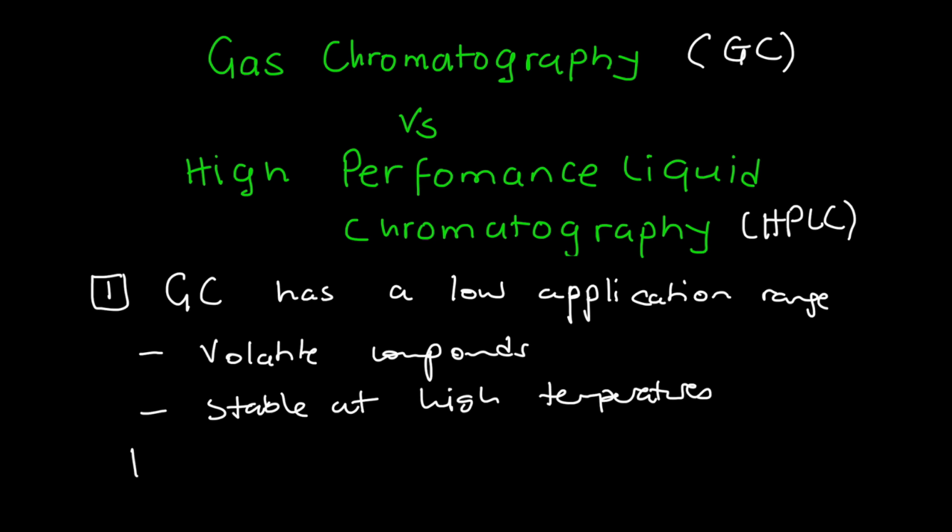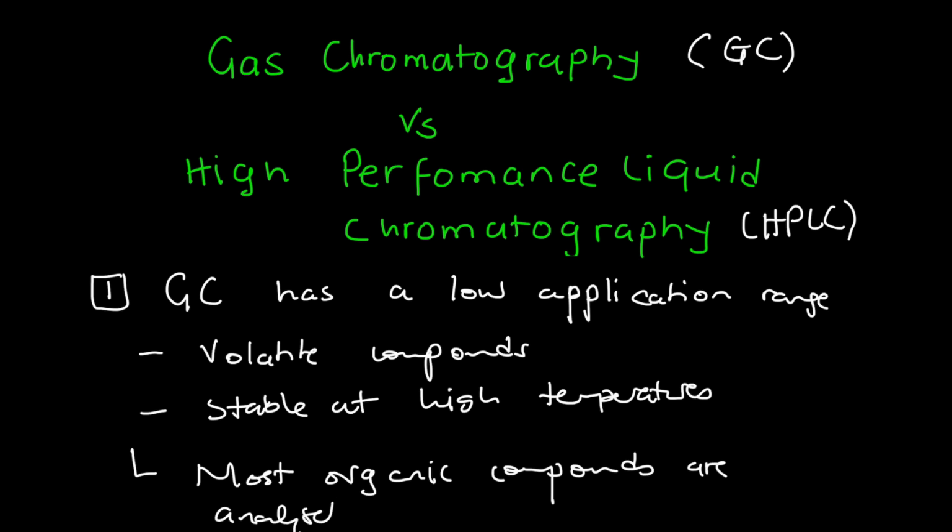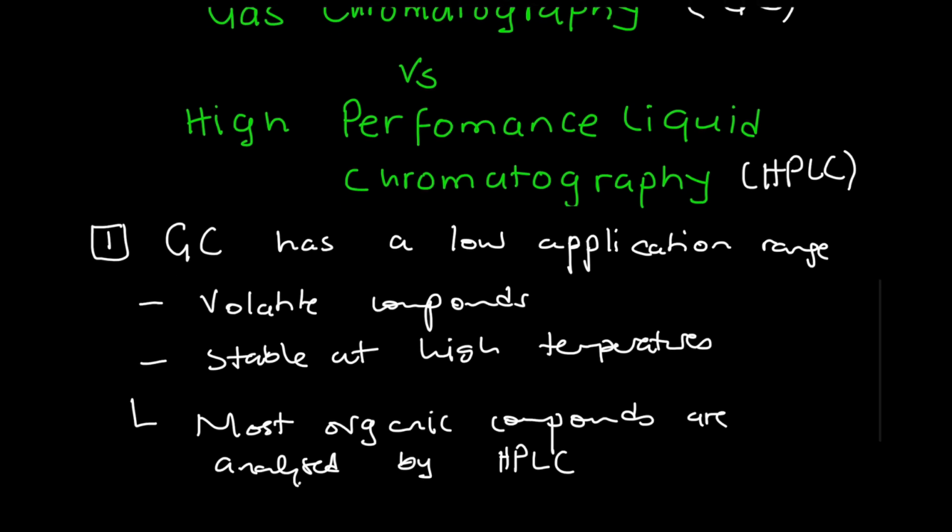As a result of this, most organic compounds are analyzed by HPLC. So HPLC has an extremely increased application range. Take note that HPLC can analyze a higher range of compounds compared to GC.